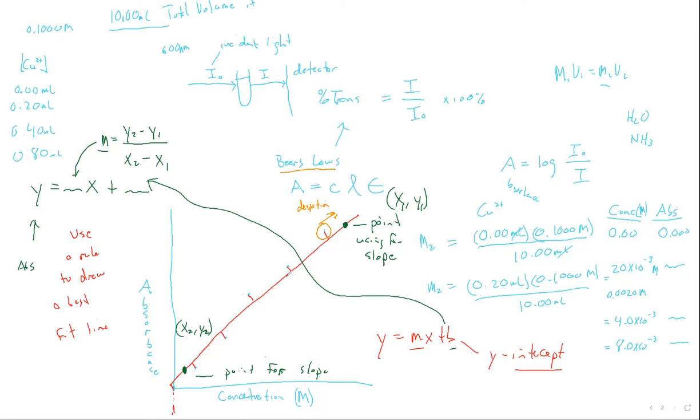So if you see that on your data, then you just circle where you think it begins. And when you draw your best fit line, you only include the early points, maybe the first 5. So you draw your best fit line to represent the first 5 points, and then you can still draw the slope. It could be on the line anywhere, right? Because the line is the line. The slope of the line is the line once you draw the line.